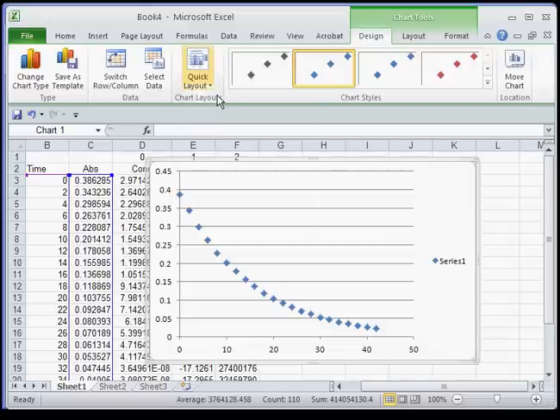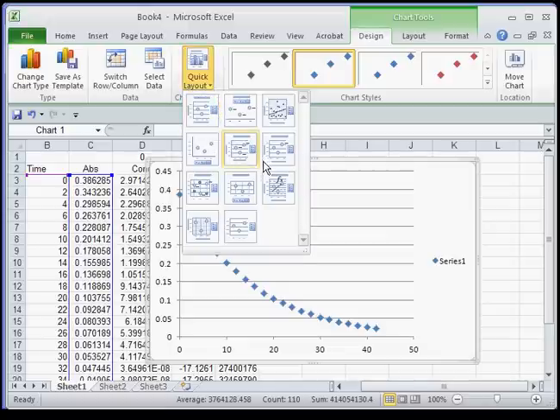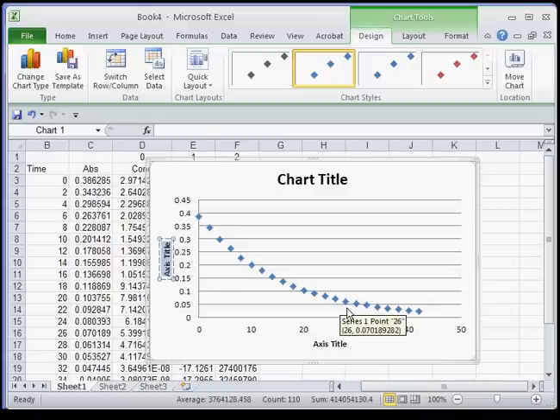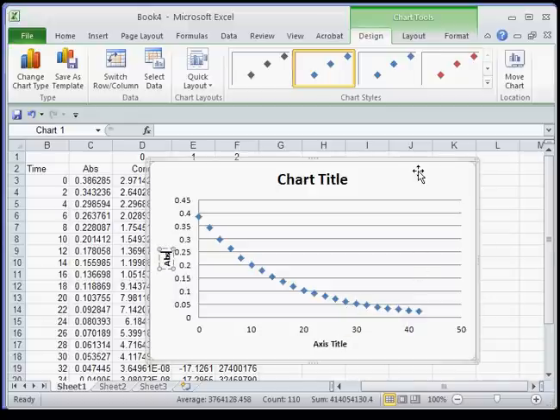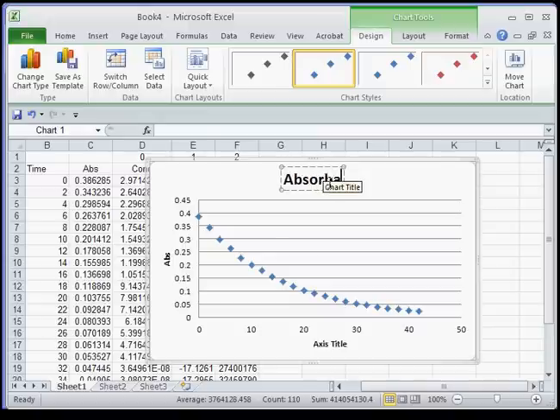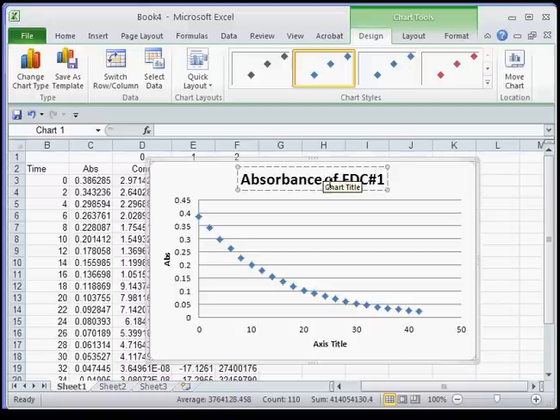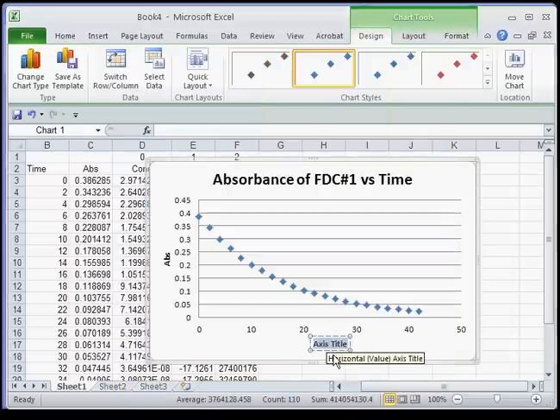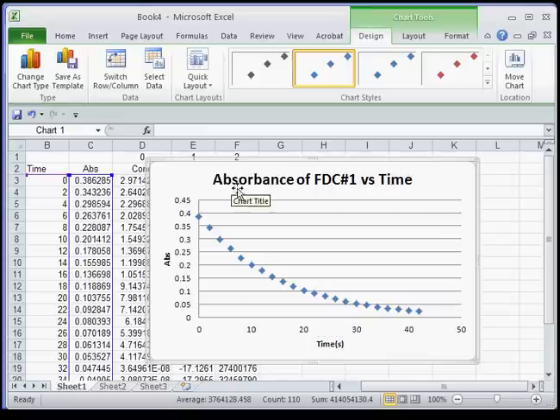Next you want to format. There are a bunch of quick layouts and some of these are pretty good for this kind of stuff. Over here we're going to type 'concentration' — or sorry, 'absorbance' — so this is absorbance of FDC number 1 versus time. The bottom axis is time. I just hit Enter to activate that. Time in seconds. So there's the first graph.